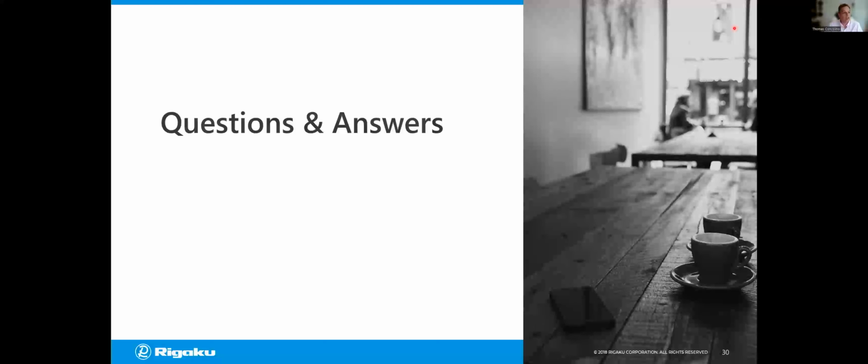All right, very good. Okay, so let's look at the next comment here from Adedayo. He's curious if this can be applied to pure crystalline polymorphs rather than the amorphous context, right? For preferred orientation, which also tends to be a limitation when you're doing Rietveld, if I remember my old data processing days. And then the total area normalization, right? Yeah. Comment on that.